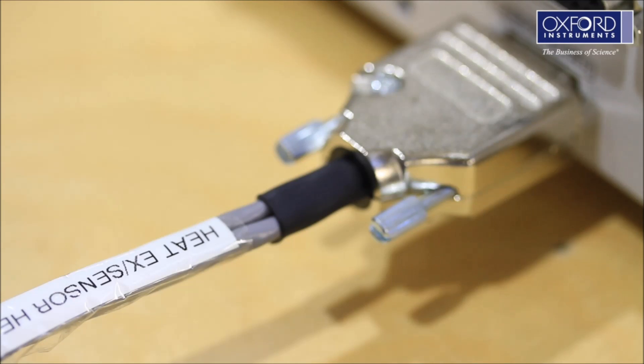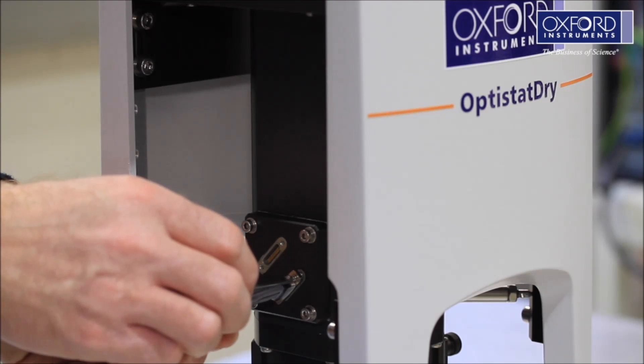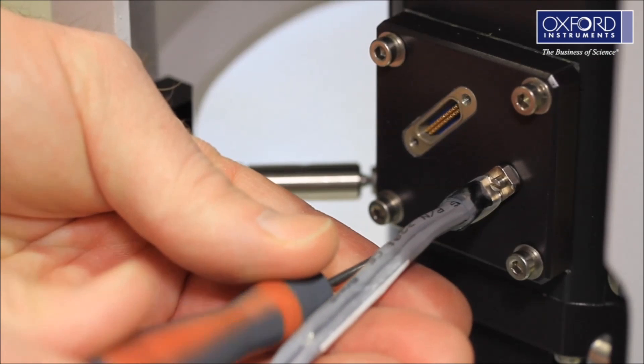Connect the other end to the 15-way micro-D connector on the cryostat. Again, tighten the retaining bolts to ensure good electrical connection.